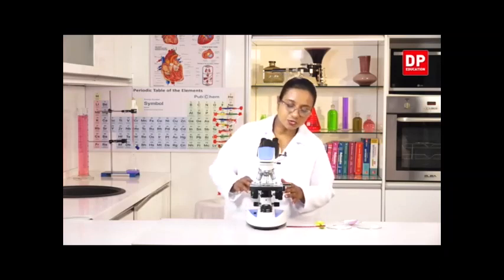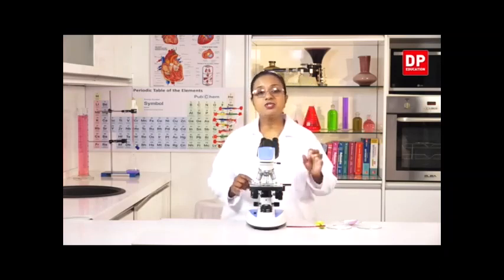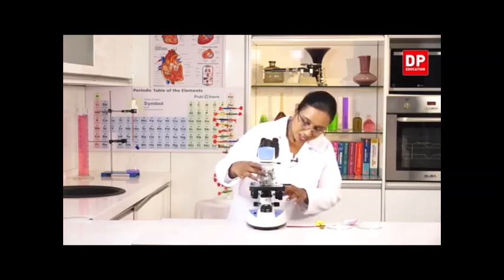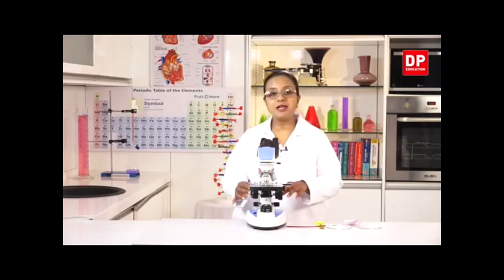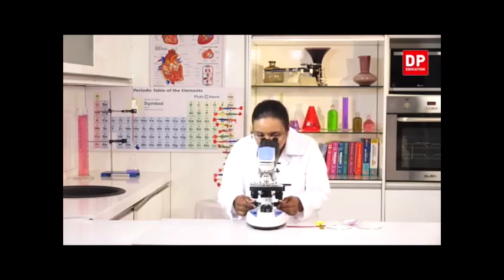So what I will do is, I will change the power to a higher power so that we can observe it even more clearly. Now I will change the power of the lens. It is a high power lens and I'll use the fine adjustment knob.